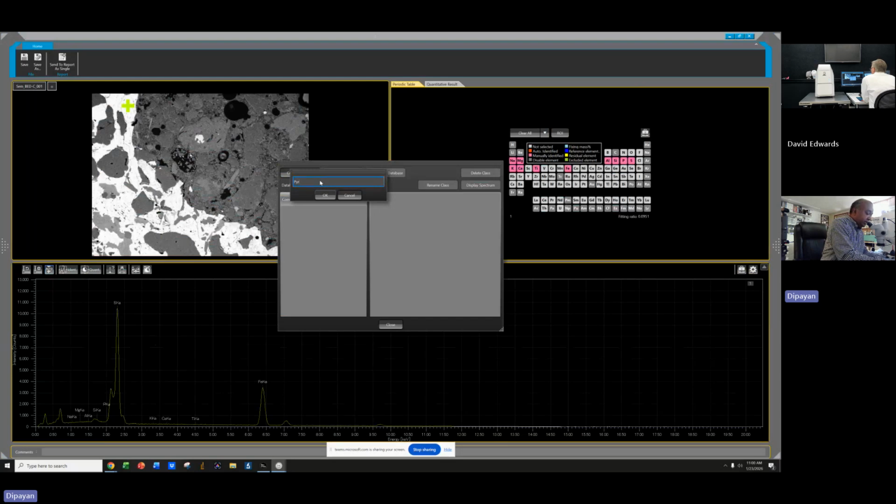I can say pyrrhotite, because pyrrhotite will come in many different forms. Right, but what you're going to keep in mind is you want to be able to choose a folder. So a database, and you're going to want to use that database for everything in the field of view that you're going to do phase.